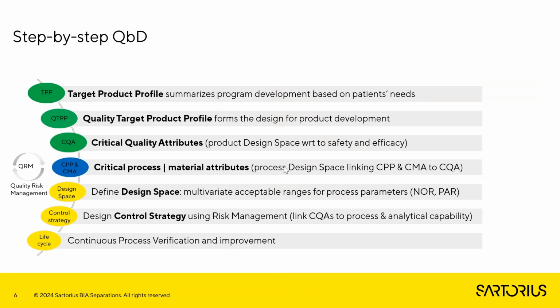And then once we have that, we start defining so-called design space, which means we build ranges for process parameters, for example, temperature, pH, concentrations of certain reagents. We'll be dealing a lot with magnesium, with NTP, plasmid, T7 polymerase in context of mRNA production.